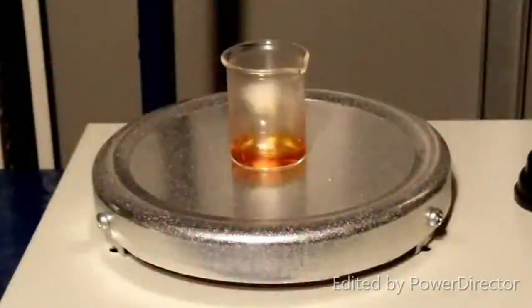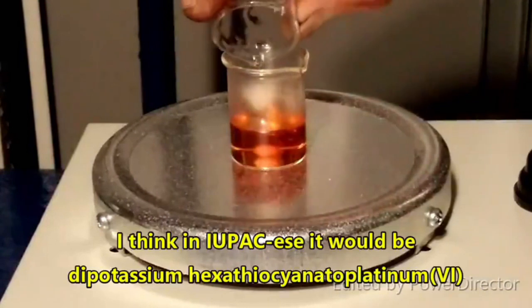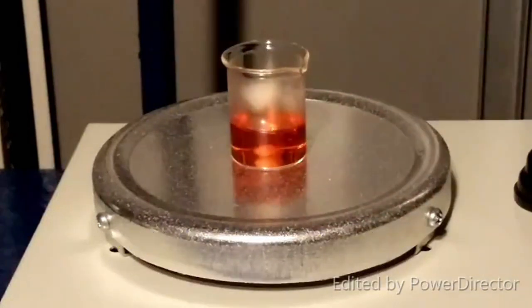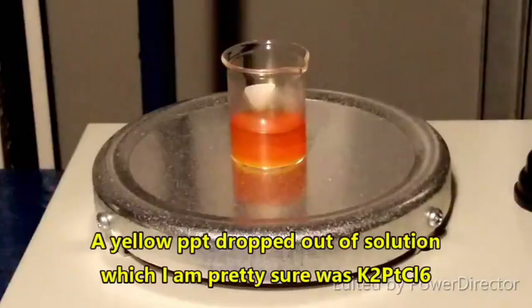Alright everybody, our next compound is going to be dipotassium thiocyanatoplatinate. This should be a dark red compound. That is an excess of potassium thiocyanate solution. Okay. It turned a color and then it went away.